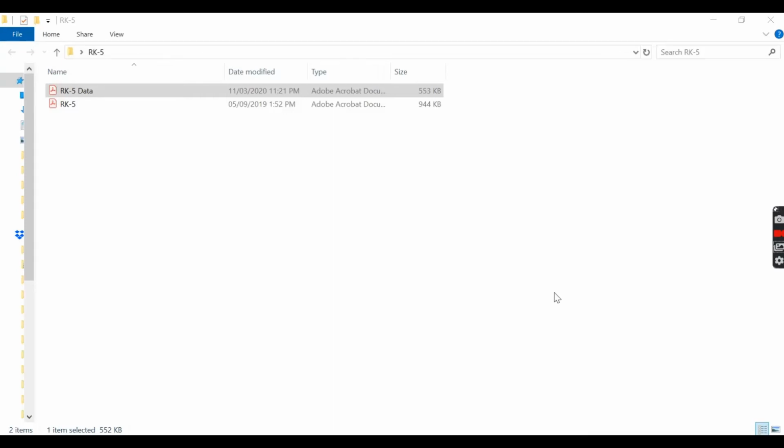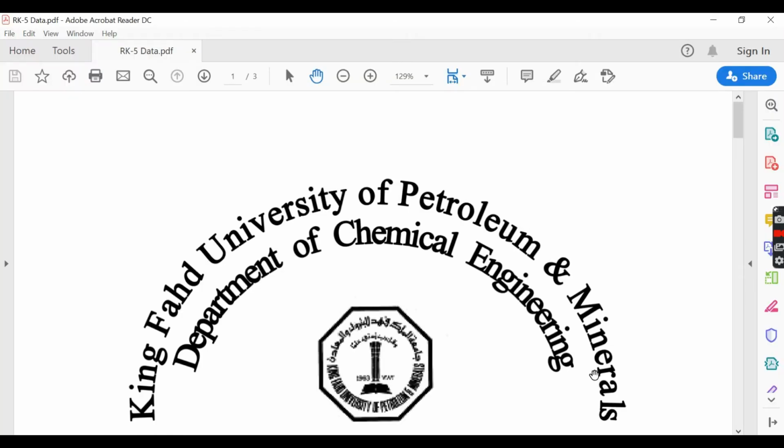This video will be about the data analysis calculation for experiment RK5. Before getting into the experiment and before getting into the calculations, you will need these two files, RK5 data and RK5. Let's take a look at RK5 data.